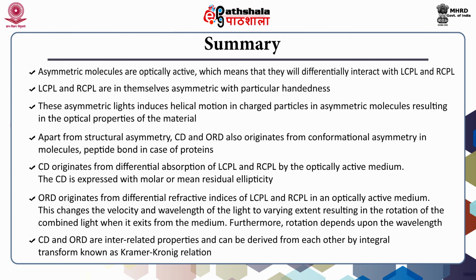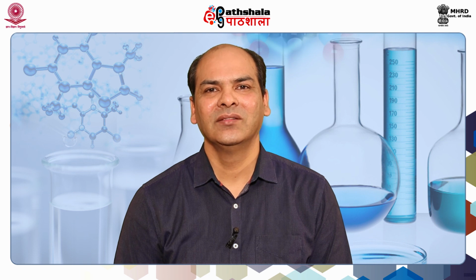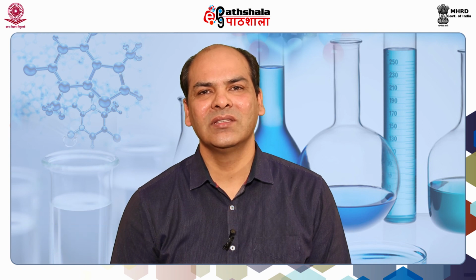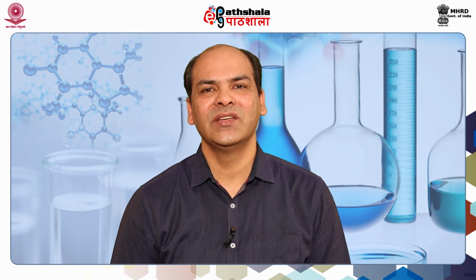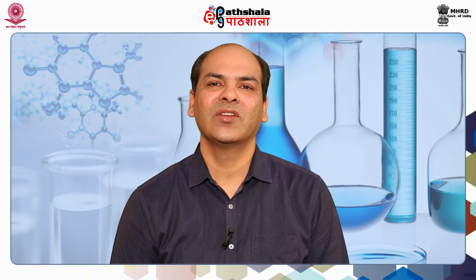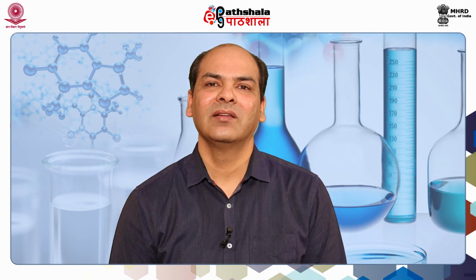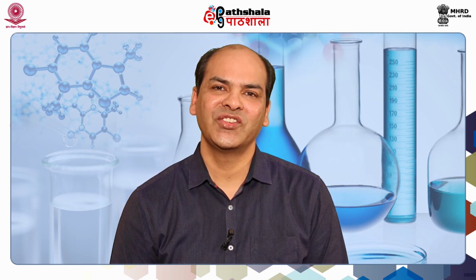So that was all for today, and we have reached the end of this lecture with the summary in the previous slide. Now we can conclude. What we learned in this lecture was what optical activity is, how it is related to asymmetry in molecules, and how to make use of circular dichroism and optical rotatory dispersion to determine their chirality, asymmetry, conformation or structure.